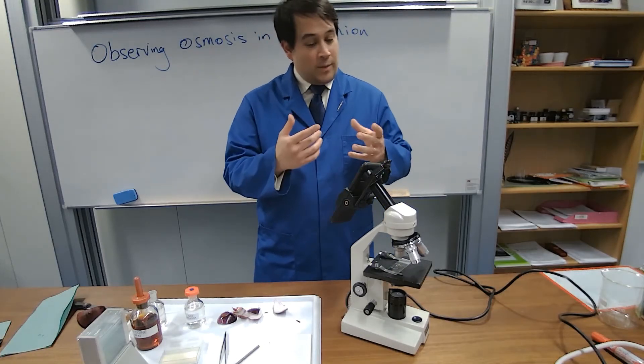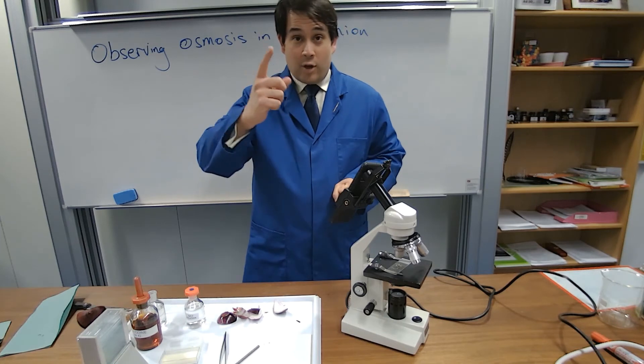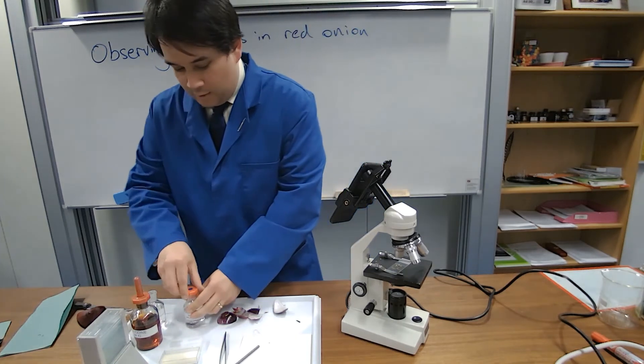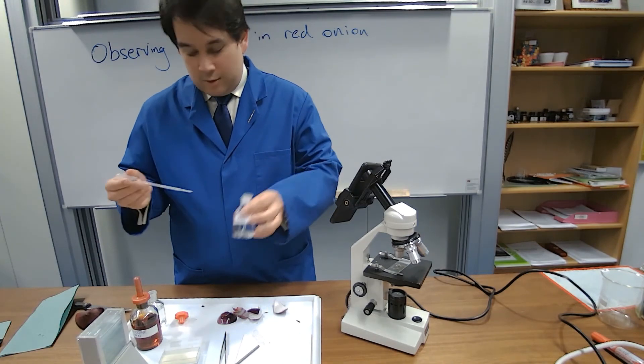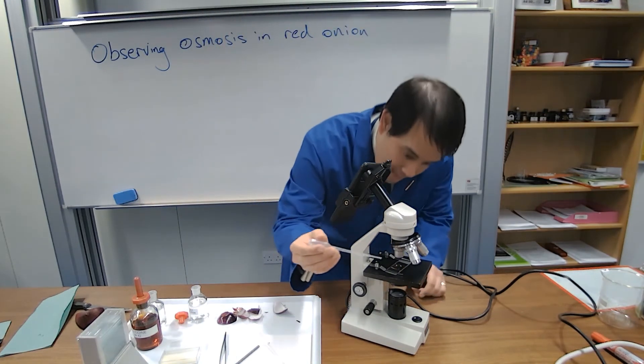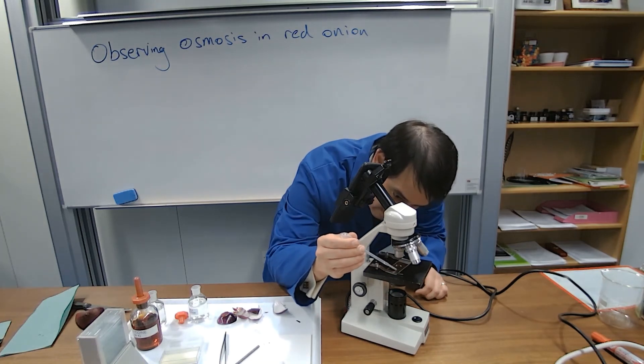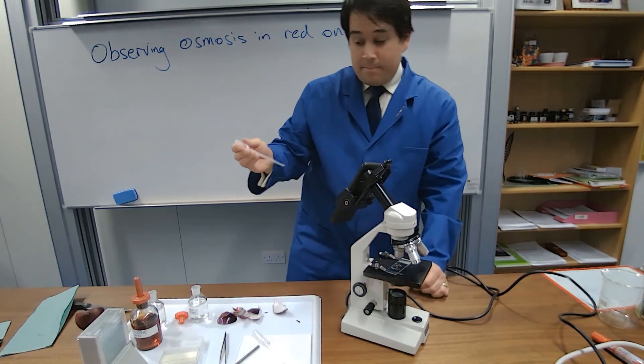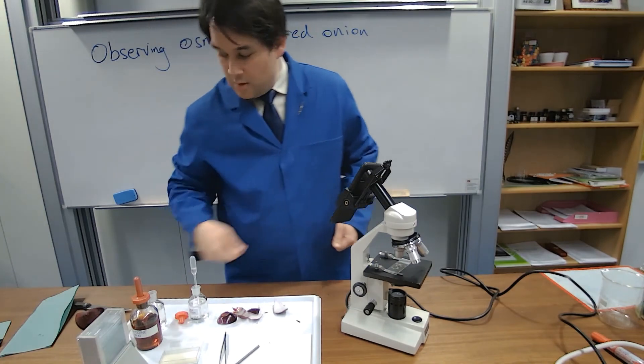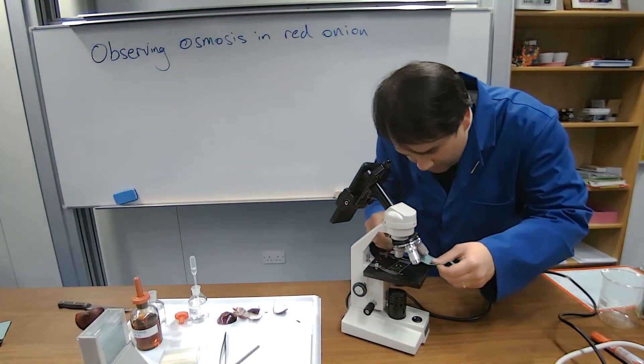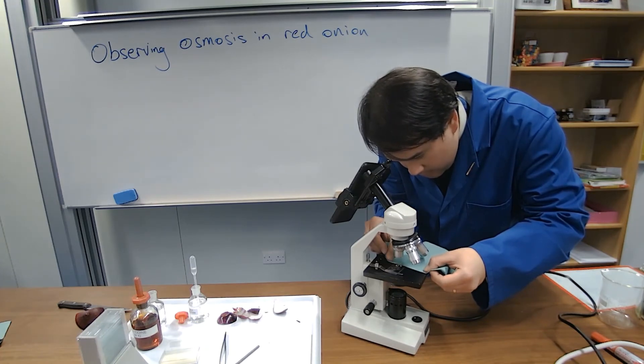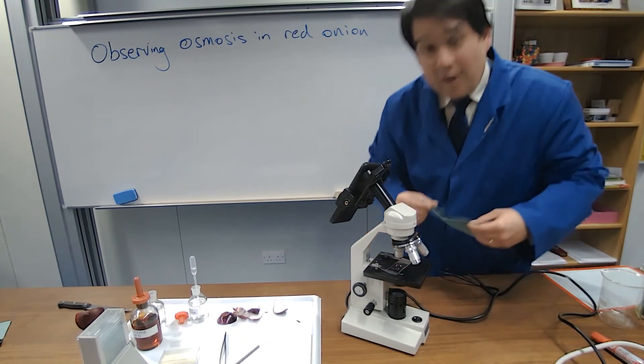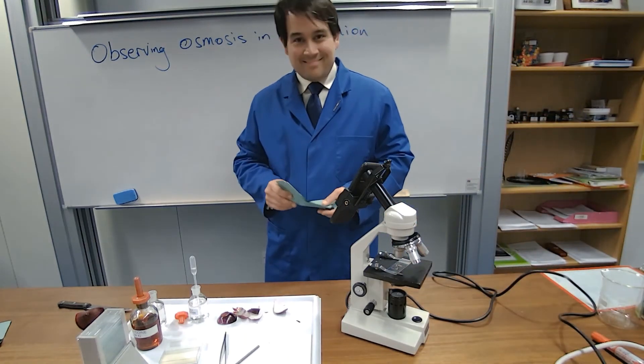So now that I've looked at the cells in water, I'm going to add some concentrated salt solution. I take a bit of the salt solution and add it to the side here, on the side of the cover slip, and then pull that through with some paper and dab it along, like that. And now the cells are in salt water. Let's have a look again.